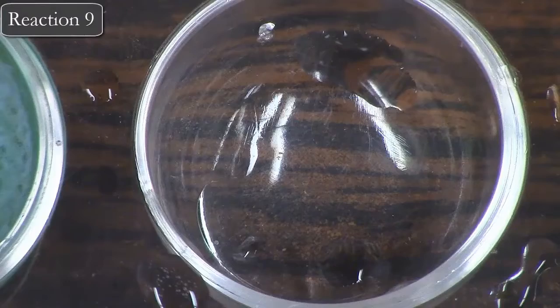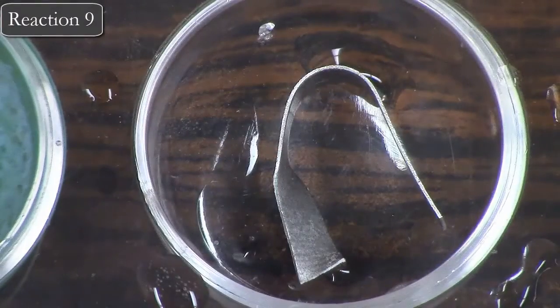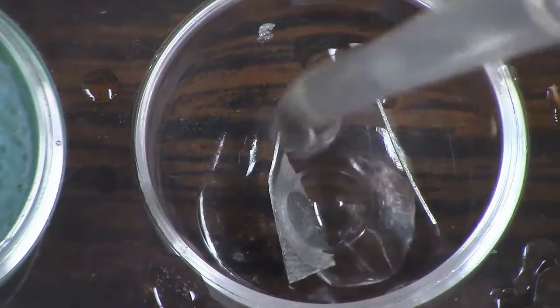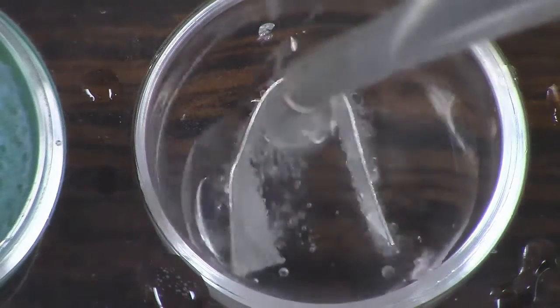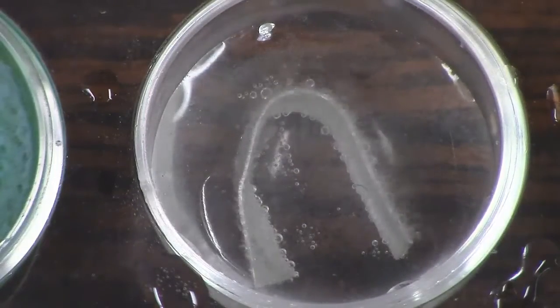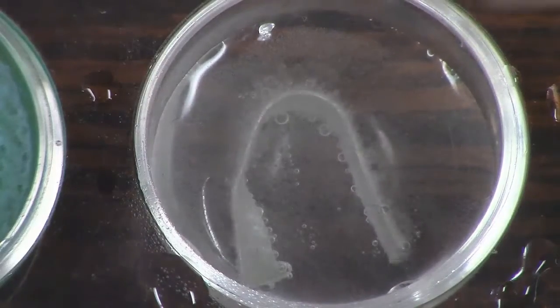All right, now reaction number 9. So in reaction 9, we're taking a small piece of solid magnesium ribbon, and then right there, we are adding a few drops of nitric acid into that same spot on the well plate. All right, so this is looking pretty aggressive.